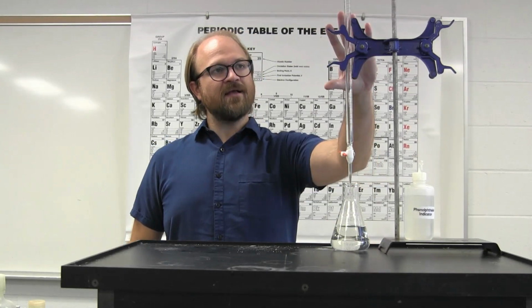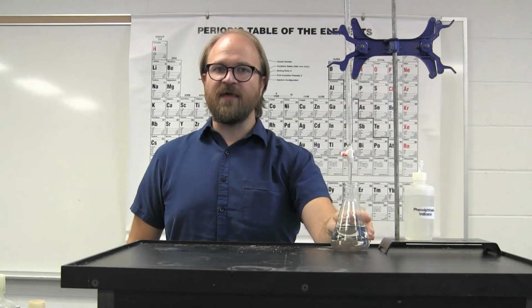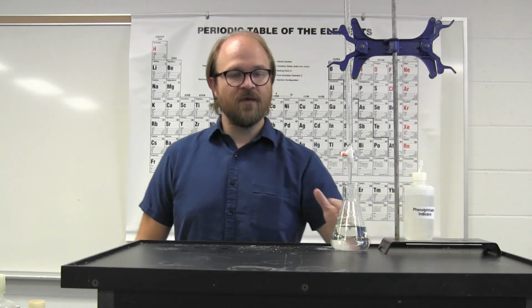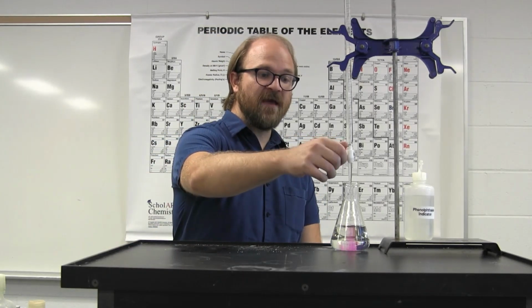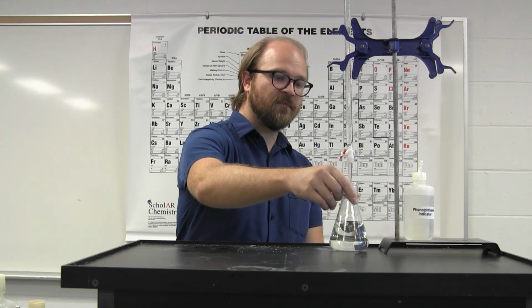The sodium hydroxide is in the burette, while the potassium hydrogen phthalate is in the flask containing the indicator of phenolphthalein. In acidic conditions, the phenolphthalein is colorless. However, upon addition of base, a pink color begins to emerge.